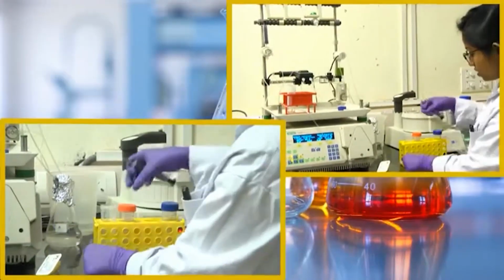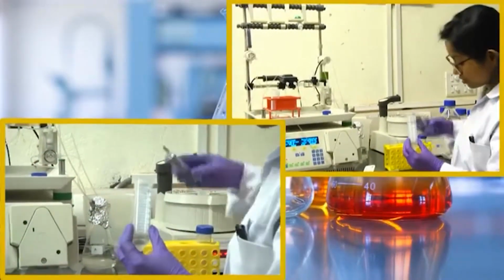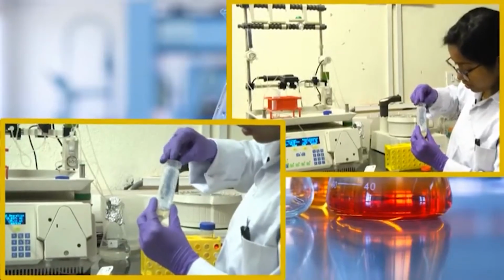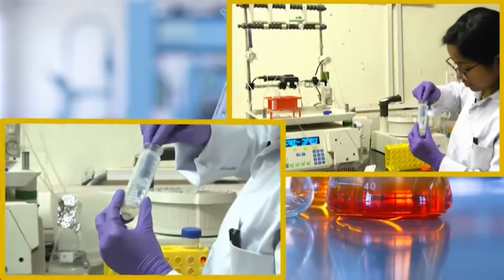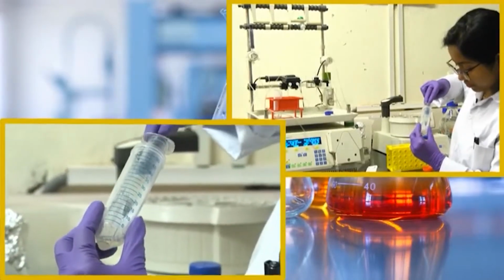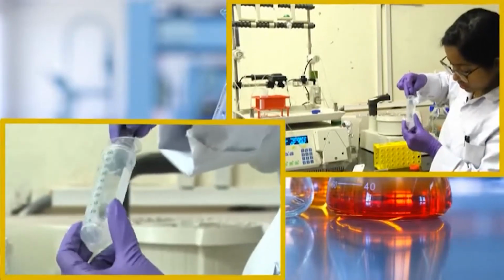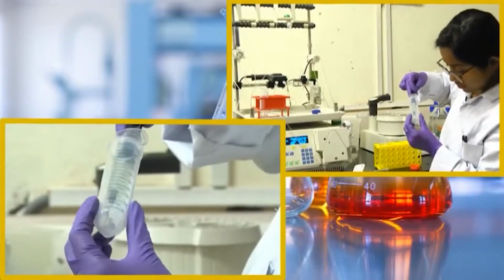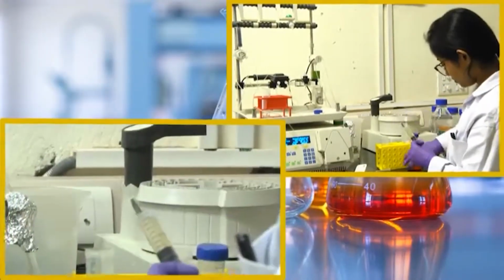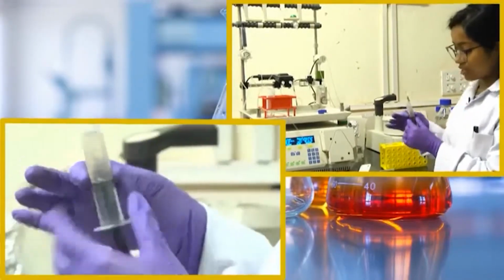So, I will take a syringe and I will take the whole solution in that particular syringe. Be very careful with the needle. Try to avoid making any bubble. So, now my protein is inside the syringe.